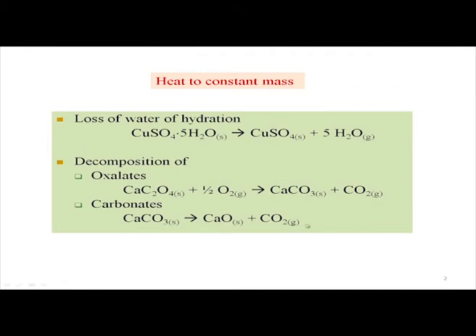So, this particular elimination of carbon dioxide, not only from your calcium oxalate but also from calcium carbonate, is a very important step to think of, where we can see that the gases coming out from those samples, we can also analyze very nicely. In one case you get the carbon monoxide. So, if this can be connected to gas chromatographic analysis, or gas chromatography attached to mass spectrometric analysis, the GCMS instrument, then this gas analysis can immediately tell you whether the gas coming out from heating of the sample is carbon monoxide or carbon dioxide.